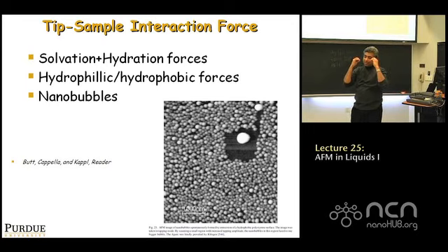So this other group that talks of interaction forces due to hydration forces says that not only do you have this exponential backbone, you have these oscillating trends superposed on it. That has to do with the fact that as you push one layer of water aside, you apply a little force, and when you remove that water layer, it relaxes. Then you push another layer of water, you get a greater force, and then it relaxes as soon as you've popped it out. So you're sort of popping water layers aside, if you will.